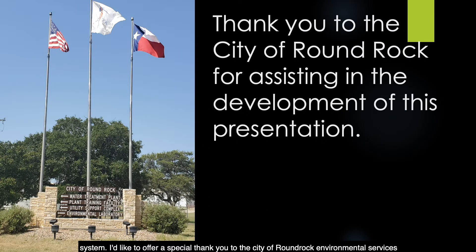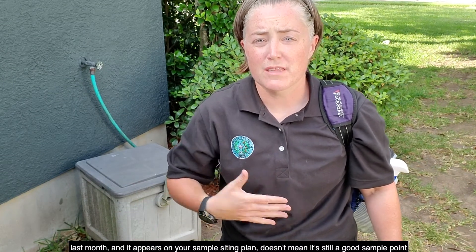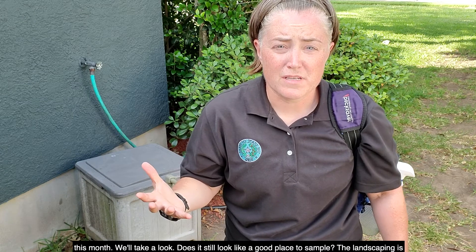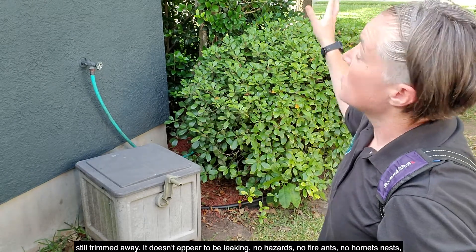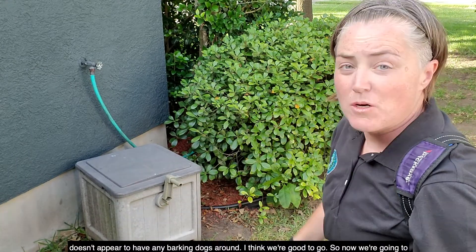I'd like to offer a special thank you to the City of Round Rock Environmental Services Department for assisting in the development of this presentation. Now we've reached our approved sampling site. Just because a site was good last month and it appears on your sample siting plan doesn't mean it's still a good sample point this month. Does it still look like a good place to sample? The landscaping is still trimmed away, it doesn't appear to be leaking, no hazards, no fire ants, no hornets nests, and no barking dogs around. I think we're good to go.